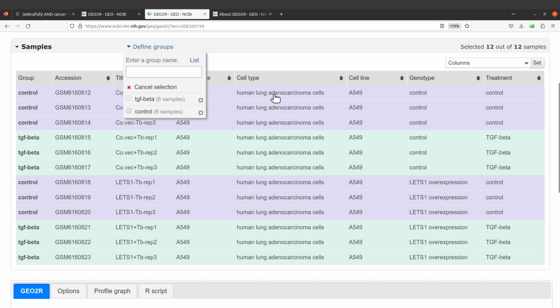Now, if you click on any of the samples, even though you have assigned them to groups, you still have this color coming up. This color simply means that that particular sample has been highlighted, or you have selected it, or you have clicked it. All right, that's the point of focus now. So when you click on a different sample, then the color that was assigned based on each group will be displayed again. So you don't have to worry if you see this color coming up.